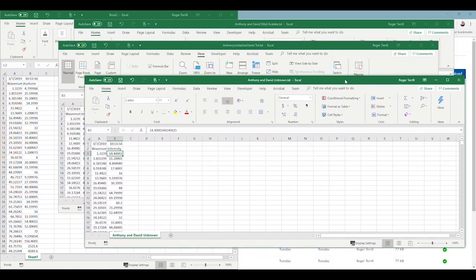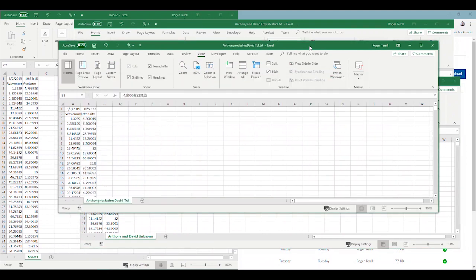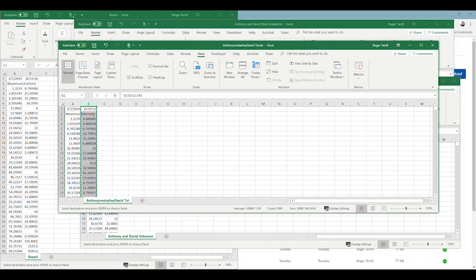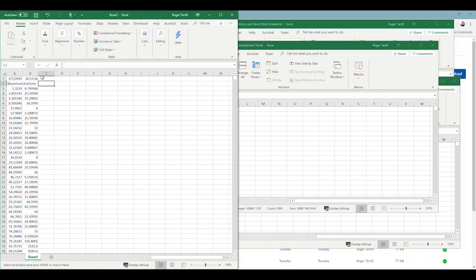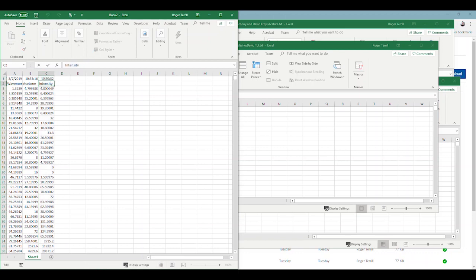Instead of intensity here I'm gonna write acetone. Now I'm gonna take this one and close it. Now for B let's use Anthony David unknown. Well let's assume this one's toluene. We'll see in a second. You're gonna take the intensity column, copy the intensity column, paste it here.